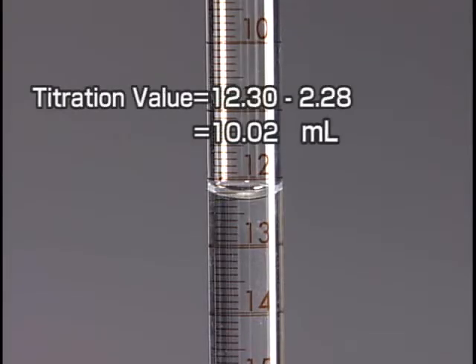The titration value is obtained by subtracting the initial reading from one at the end point.